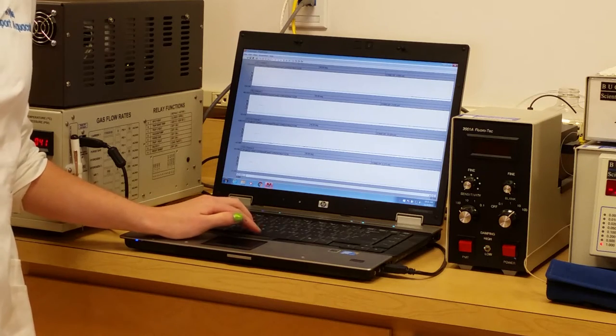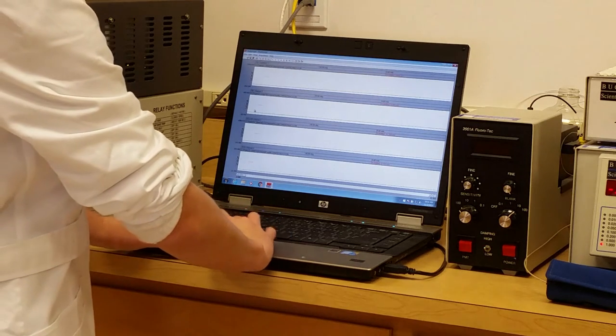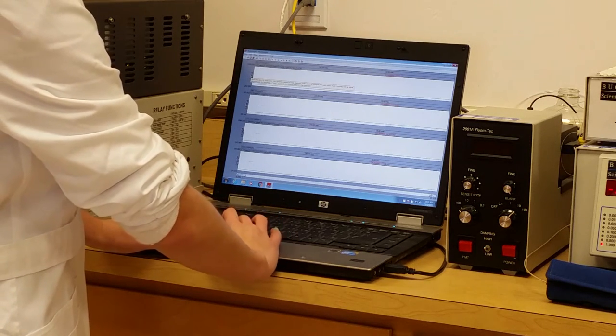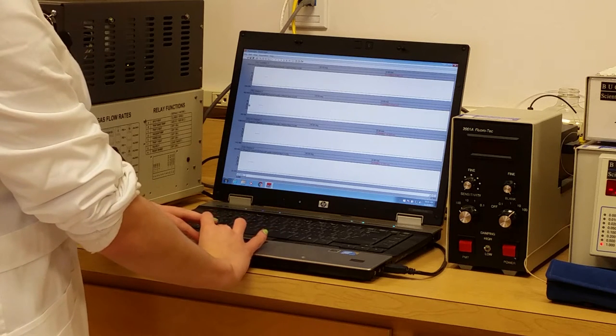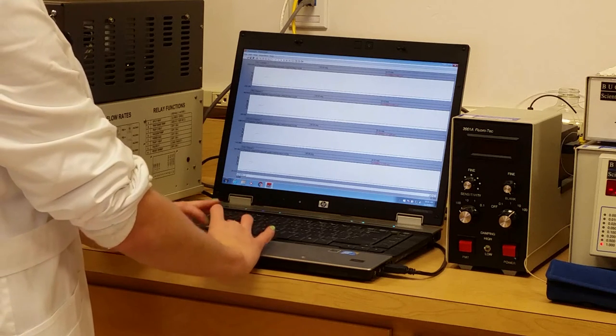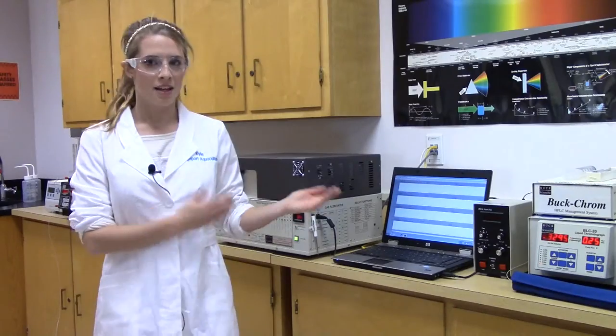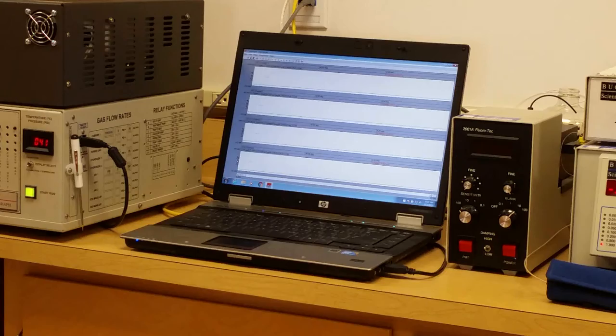The next step is to start the run. This is done by hitting the space bar and then zeroing each instrument or each scanner. You push the zero button in between the two magnifying glasses on each one. The scan will start running and typically run from 15 to 20 minutes to make sure everything has gone through.